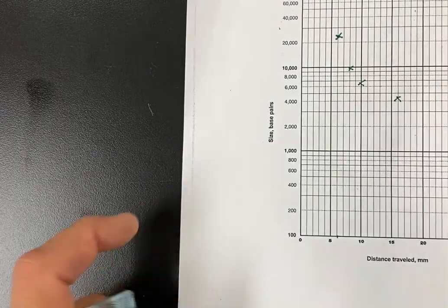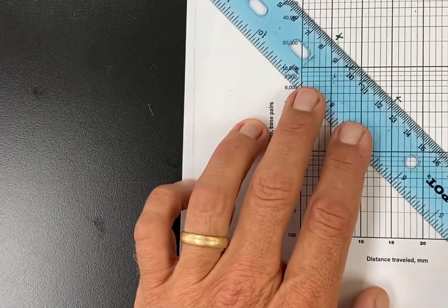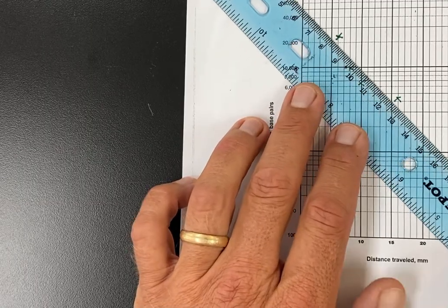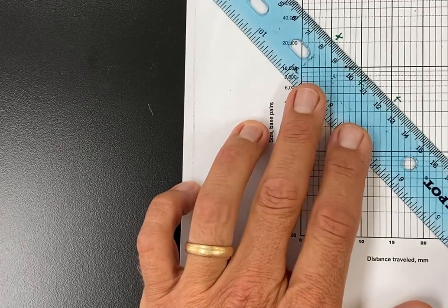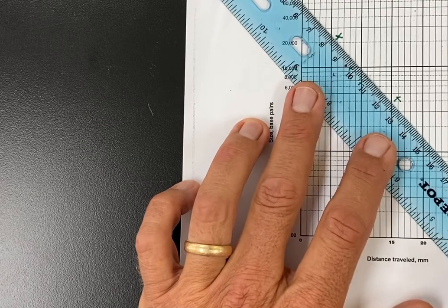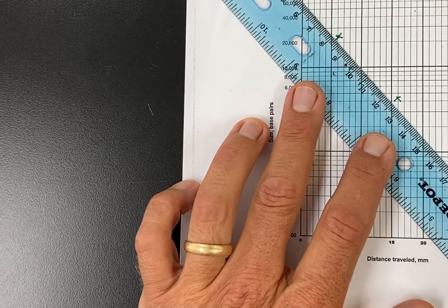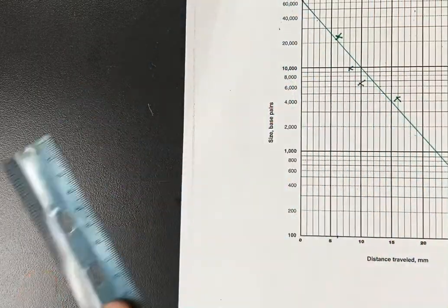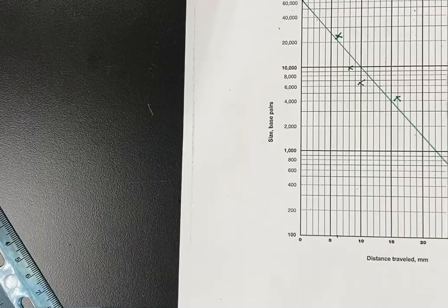So I'd like to see this to be a straight line, so what I'm going to do is I'm going to try and make a best fit line that kind of gives the average of all of those. Now not all dots need to be on there, maybe a little bit steeper here, something like this, and that gives me my standard line.